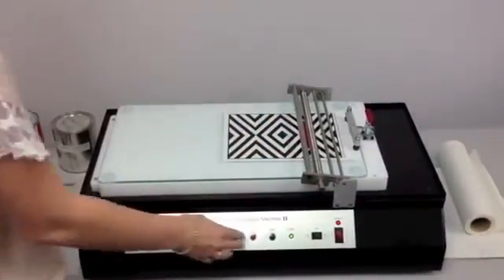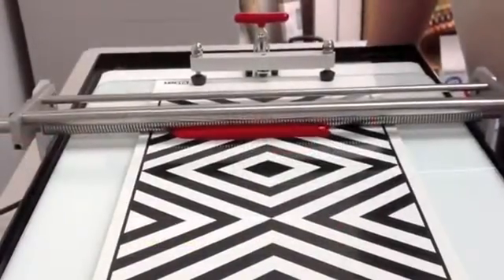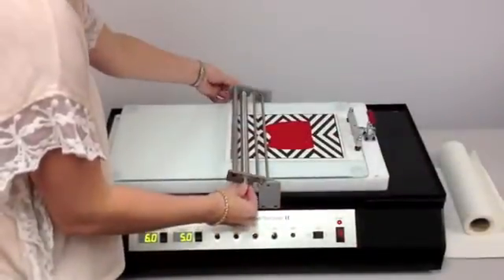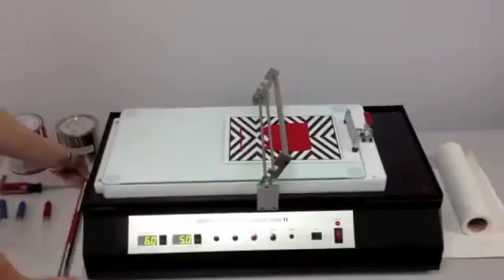Momentarily depress the start test push button to start the unit. When the drawdown comes to a complete stop, the test is completed. Lift the armature and reset the system by depressing the home push button.